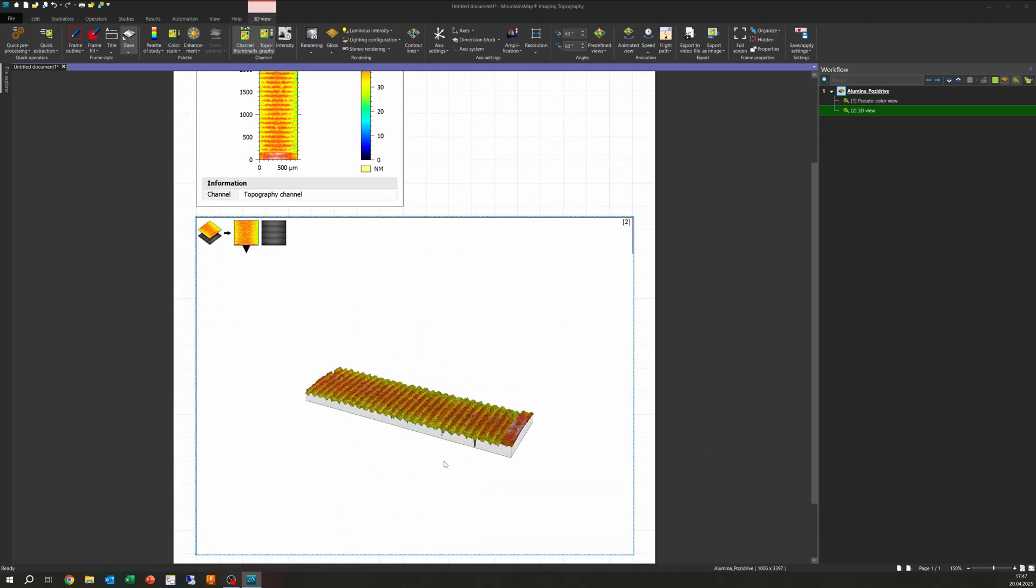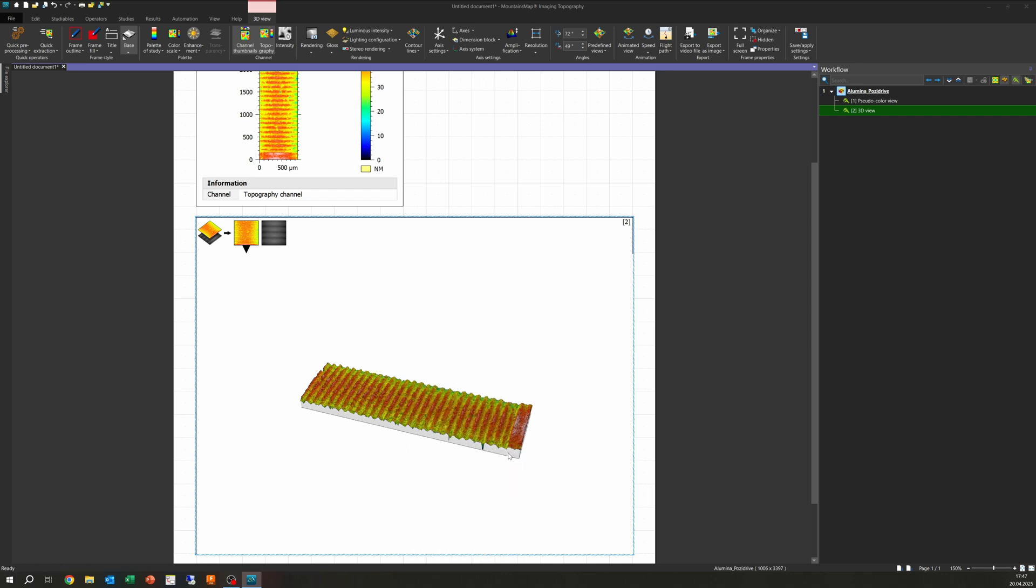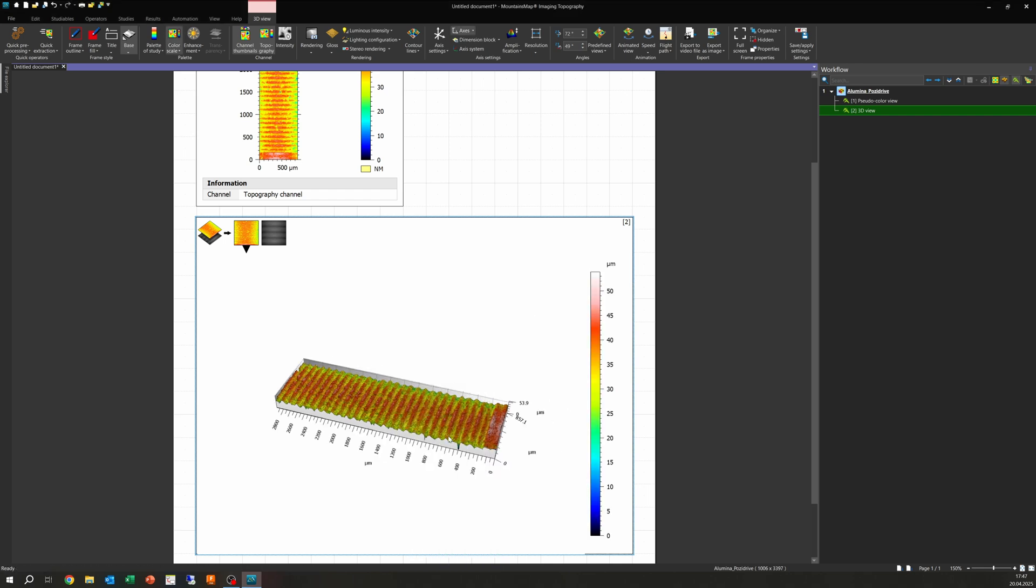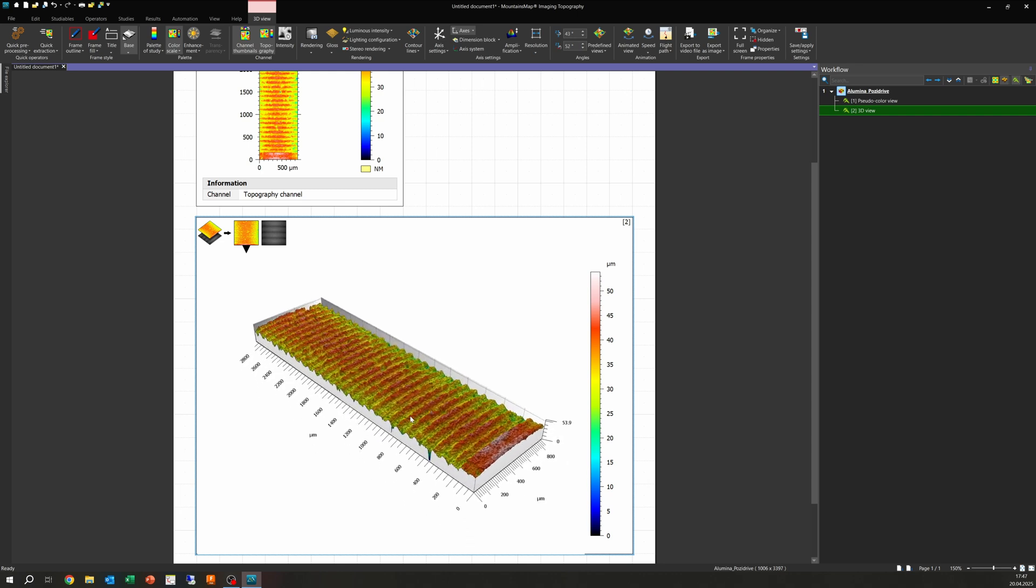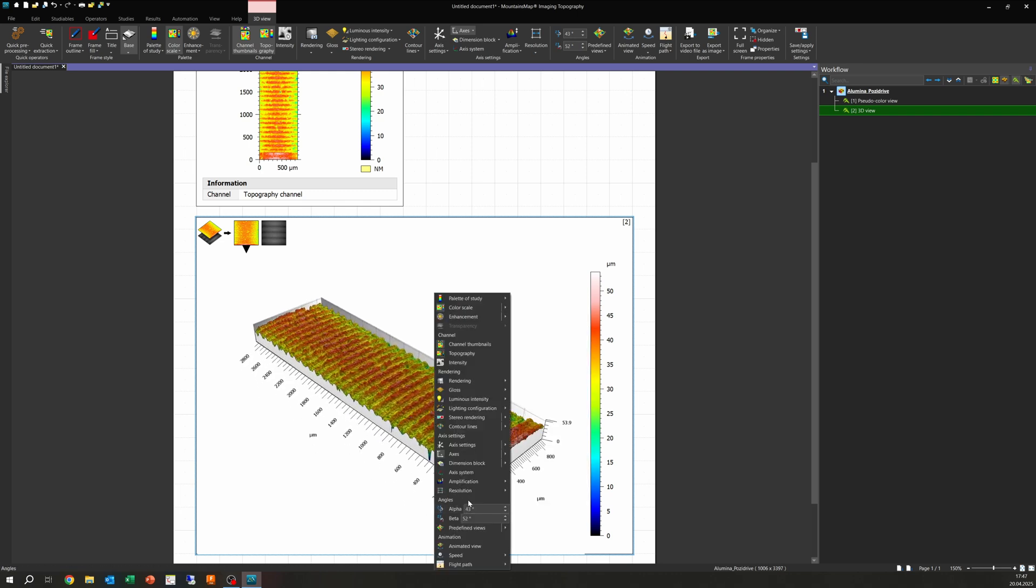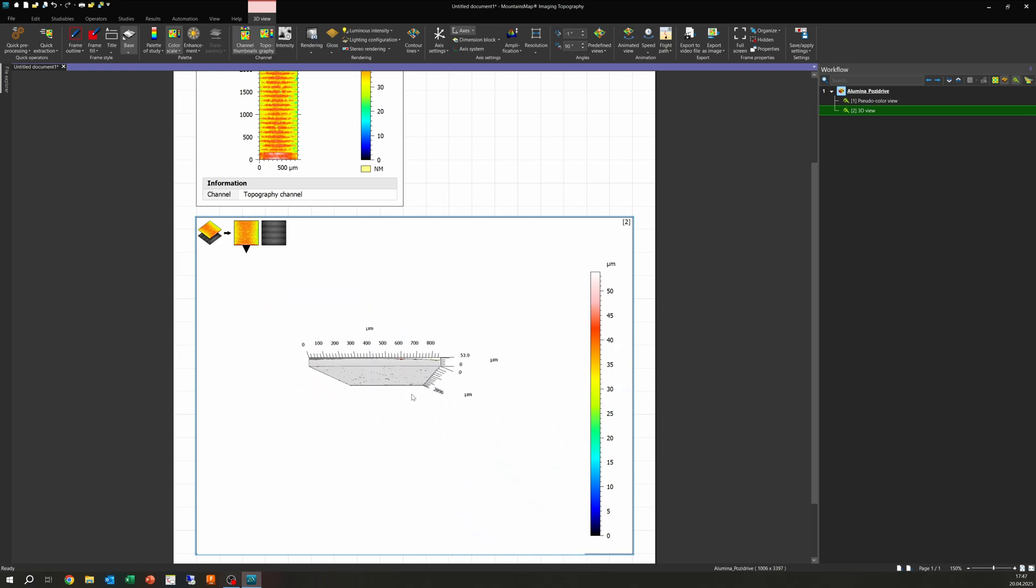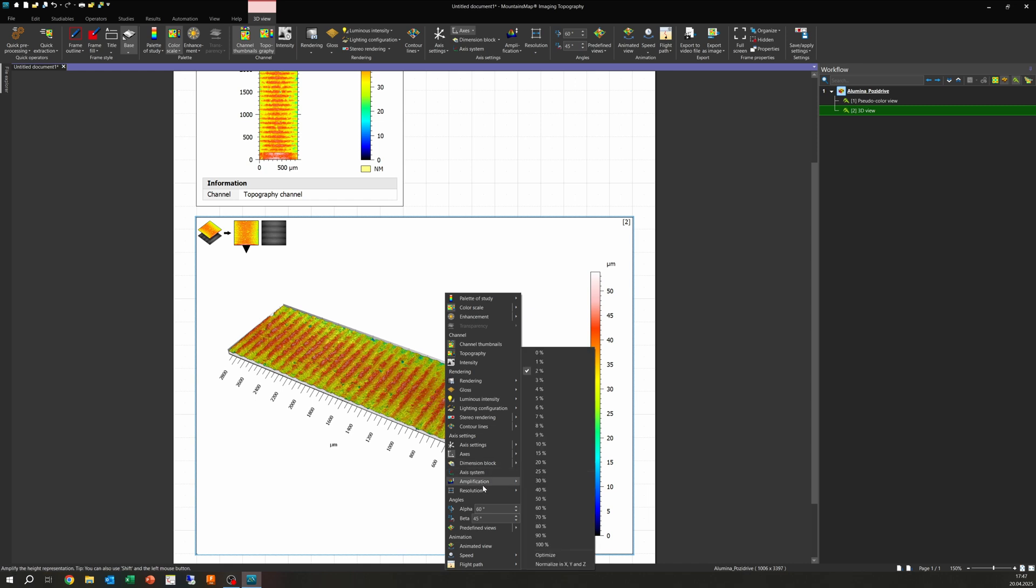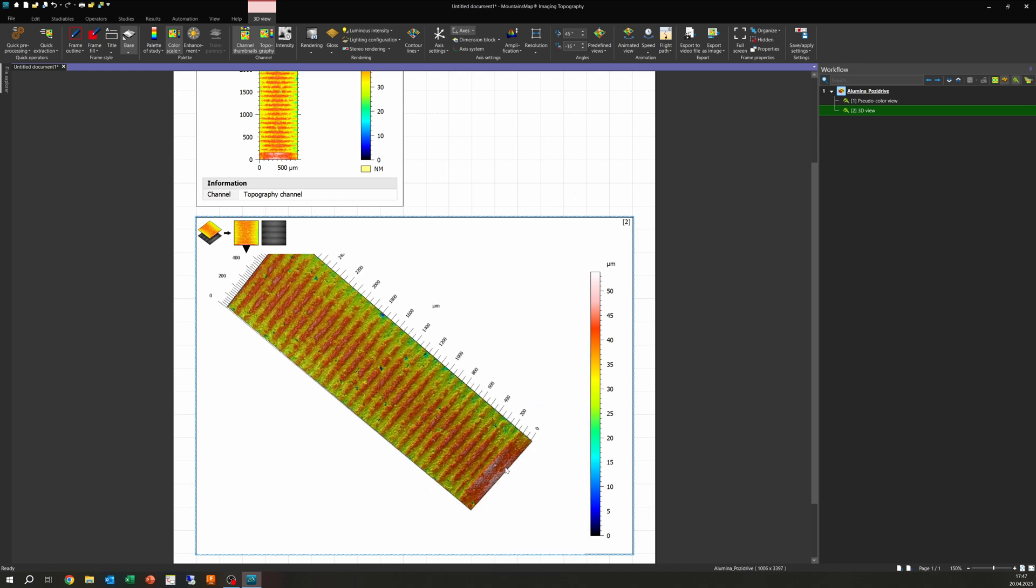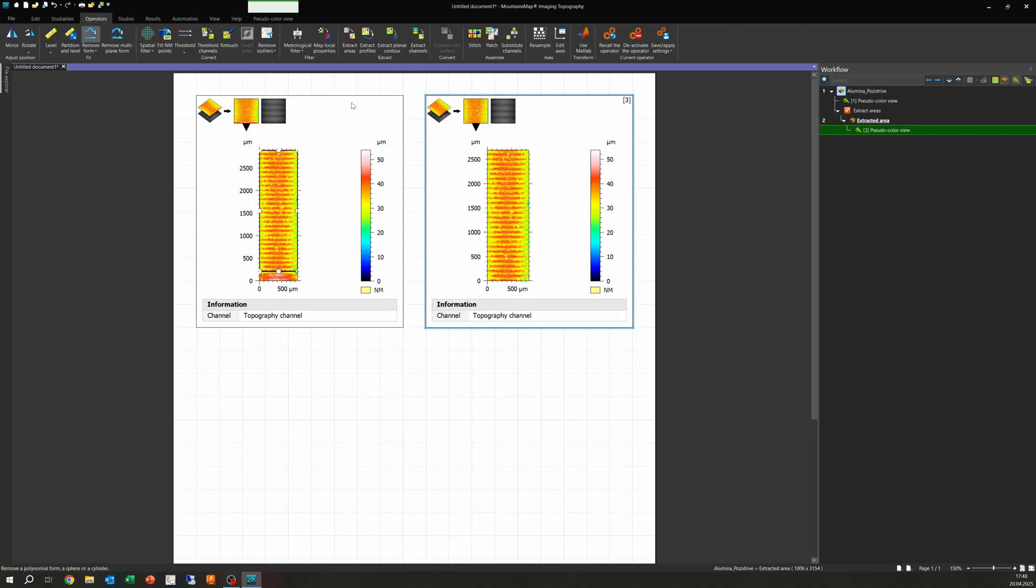If we take a look at the 3D visualized data, you can see some curvature, some longer wavelength form deviation, which is called waviness, but also micro roughness from measurement noise. Our goal will be to select and filter the data so we arrive at a usable data set for surface roughness. This is based a lot on the standards for aerial surface measurements, such as ISO 25178. My focus here is to limit the frequency range of the surface to the wavelengths of interest, namely the SL-limited surface.